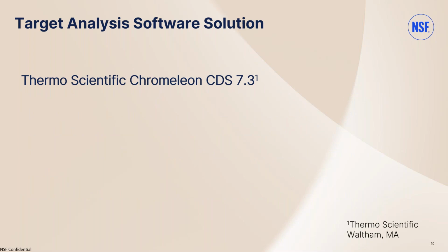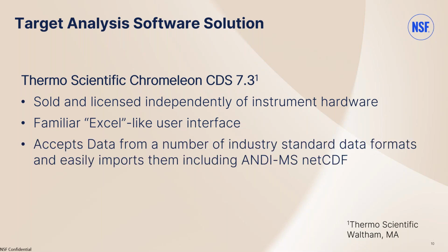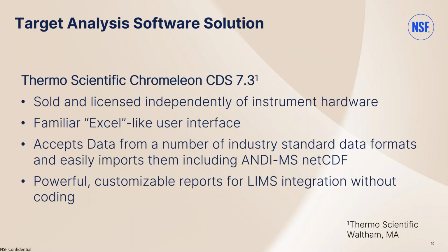And so for our target analysis, we settled on Thermo Chromeleon as our desired CDS. It's sold independently of the instruments, and it can natively work with a lot of different vendors' instruments. Also, the interface is much like Excel, so the training is pretty minimal. It's fairly easy to learn. And it can accept the open source data format ANDI. And using the Excel interface, there's powerful customizations available, so it made LIMS integration very simple.